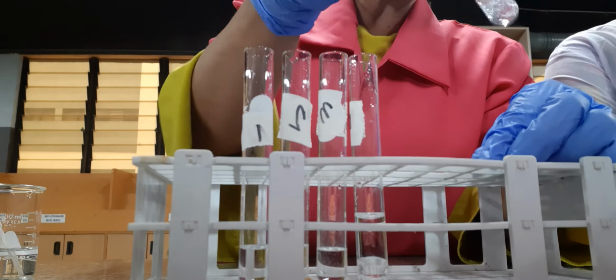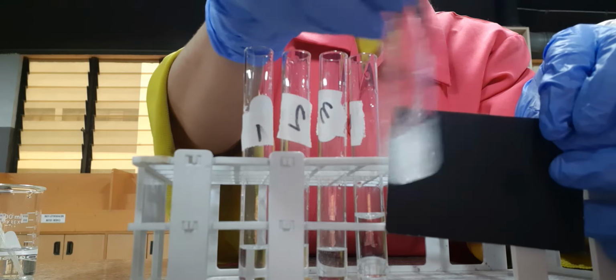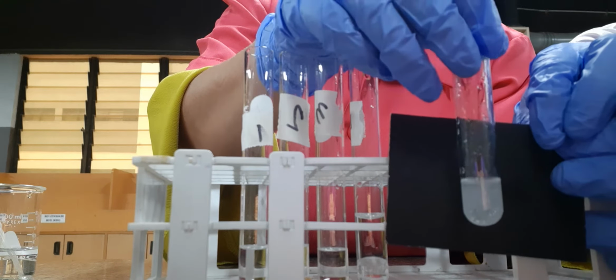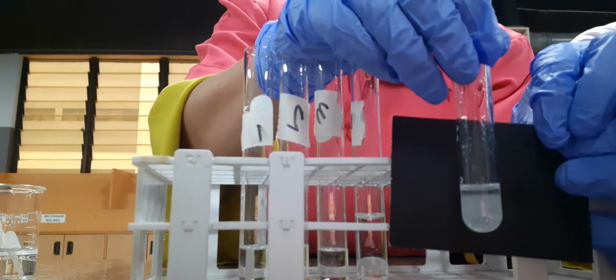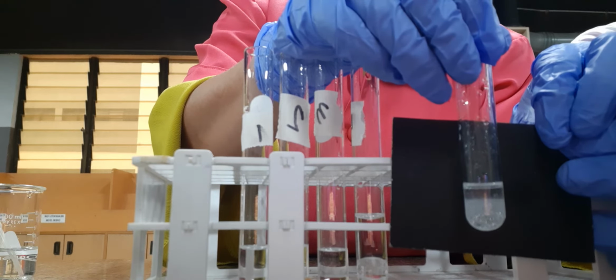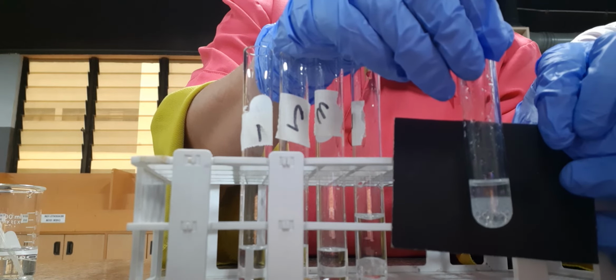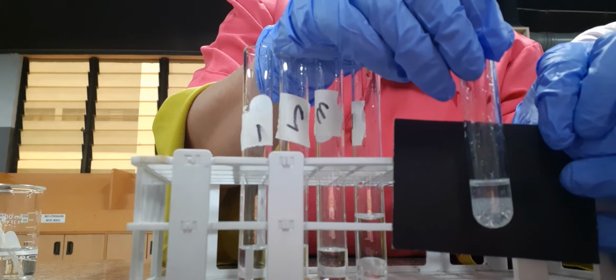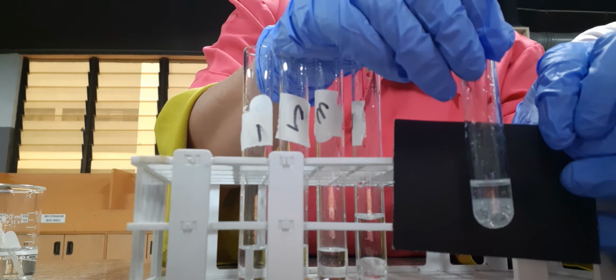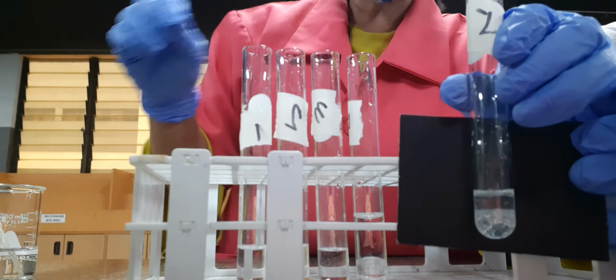Okay, immiscible. Next, we have acetophenone. Once again, how does acetophenone look when it is in water? There the mixture tries to separate one from the other. Try to look at that. Therefore, they are immiscible since they form layers.